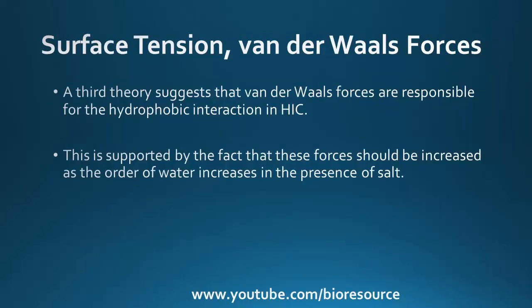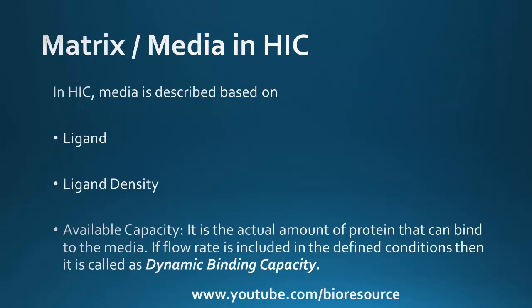A third theory suggests that van der Waals forces are responsible for the hydrophobic interaction. This is supported by the fact that these forces should increase as the order of water increases in the presence of salt. In HIC, media is described based on the ligand density and the available capacity. The actual amount of protein that can bind to the media is called the available capacity.